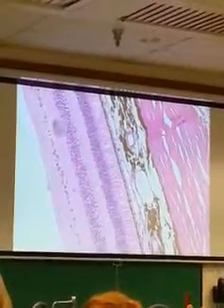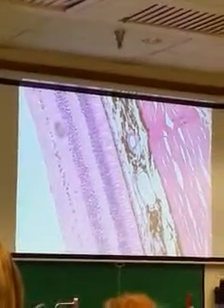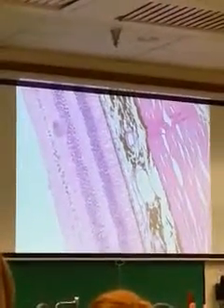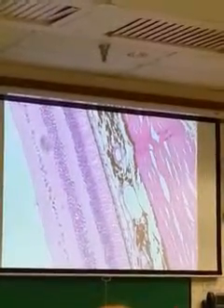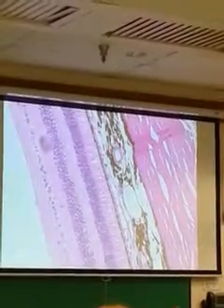Again, the purple dots are nuclei of bipolar neurons. So it's the light pink and the purple dot? The purple is the nucleus, the pink is cytoplasm, so we're seeing the whole cell. Bipolar cells. And now the next row, this is where we have ganglion cells.